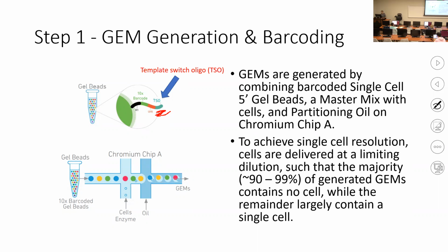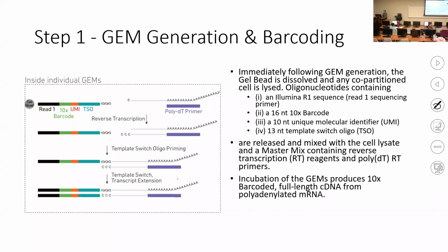You have this bead preparation, and then you have partition oil, and you try to capture individual cells. In this case, we will focus on immune cells. Okay, you can have blood cells drawn, and here you capture either B cell, T cell, or some other cells. But we will be able to differentiate the T cells out of other populations. And also, that's the design for this template switching oligo. And so now that's the procedure.